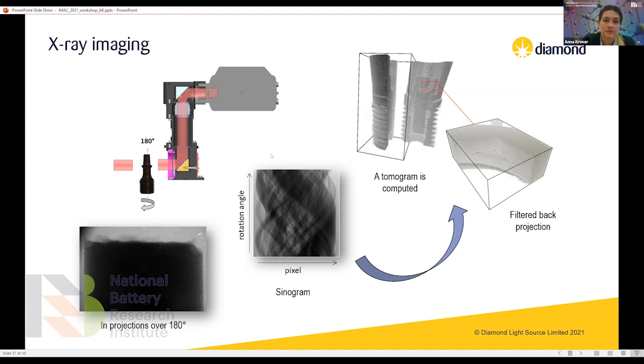That will give us, that's more or less what we get. It doesn't really provide much information if we look at the sample in 2 dimensions. But then if we use one of the planes of the sample across, we get the sinogram, and then applying the Radon transformation, we obtain the tomogram. So we can really study the sample and get complex information on the internal structure.